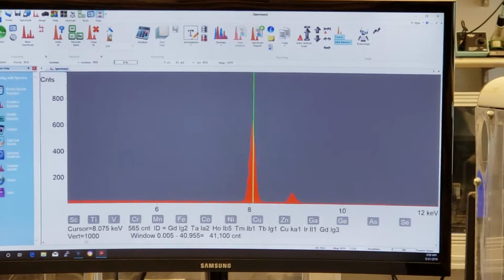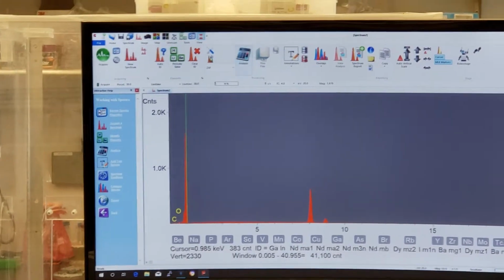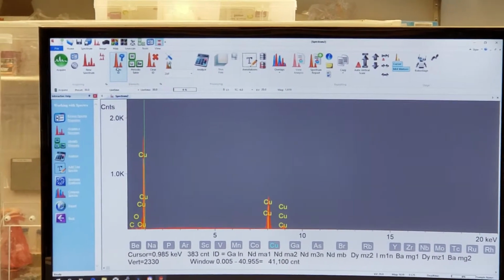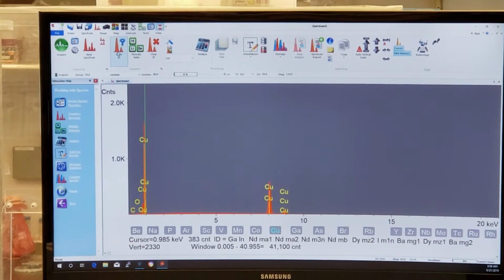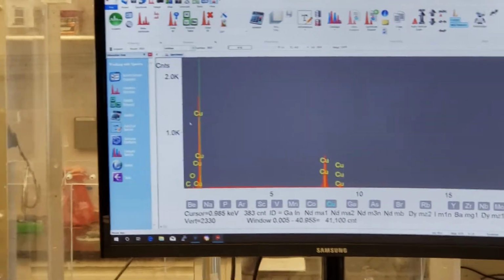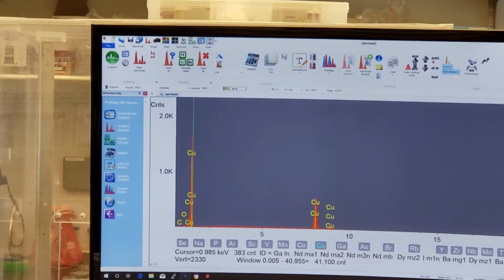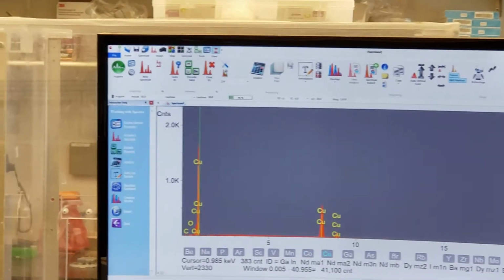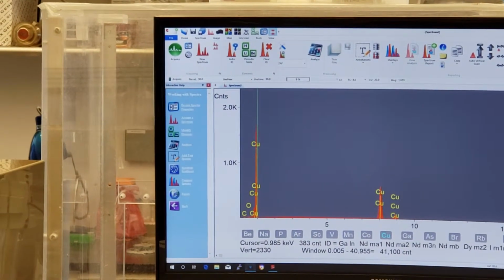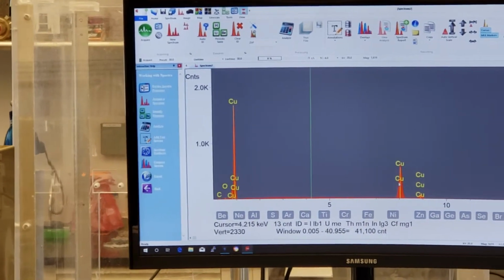And now the fifth way of labeling is, if I don't know what's there, up over here on my EDS string, see where it says auto ID, the question mark? You tell me what's there, and it goes ahead and labels it. That's the easiest way of labeling, but I had to go over all the ways of labeling. It'll do everything, but also sometimes it gives you erroneous results as well, because auto ID is not the most accurate thing in the world, just to let you know. But it will give you all the labels, then you could go back and deselect your elements.